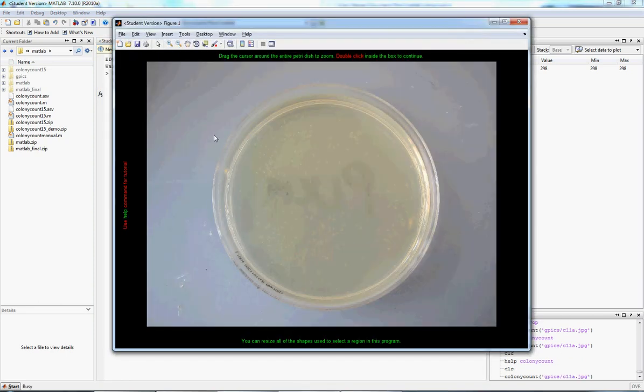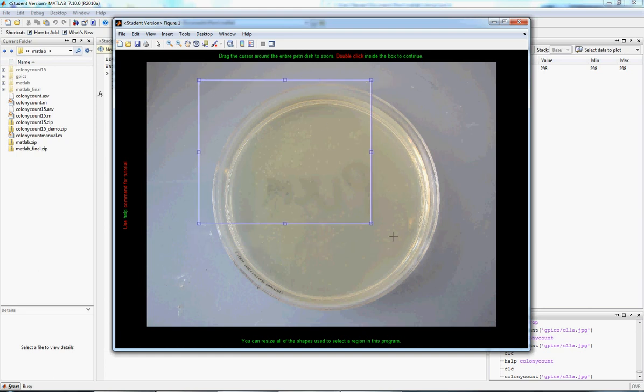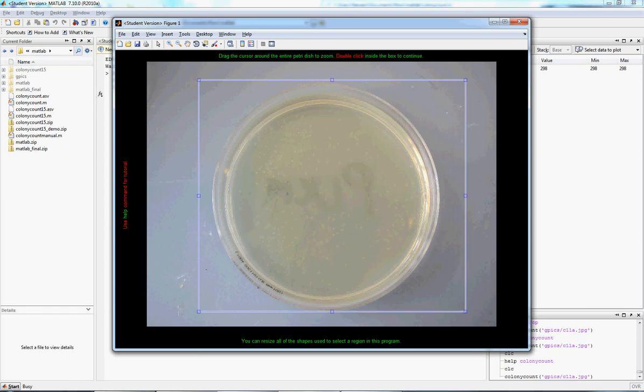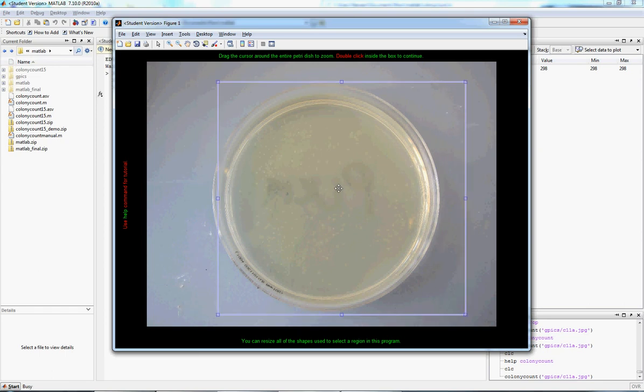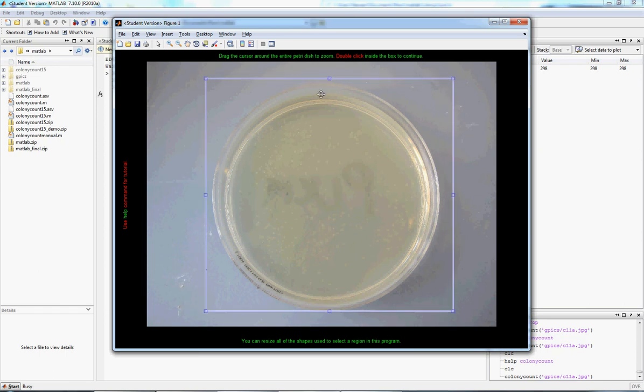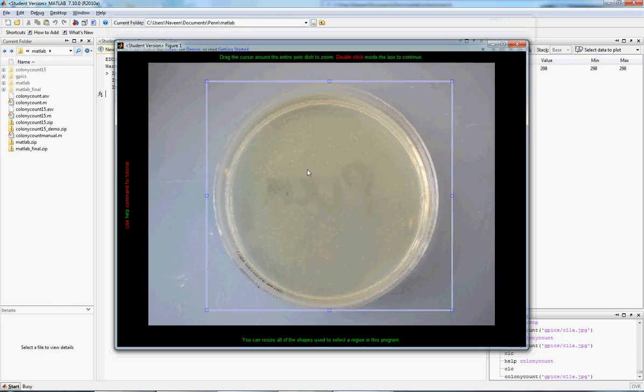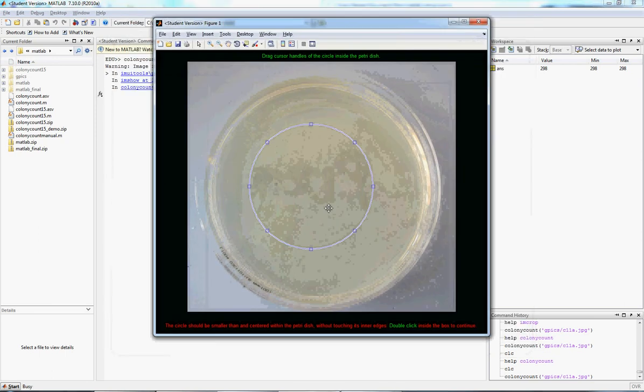So from there, it pulls up the picture, a little reminder to use help if you need any more tutorials. You drag the cursor around the entire dish to zoom in. We can move it around, we can resize it, whatever you want to do. Double-click inside when you're done.